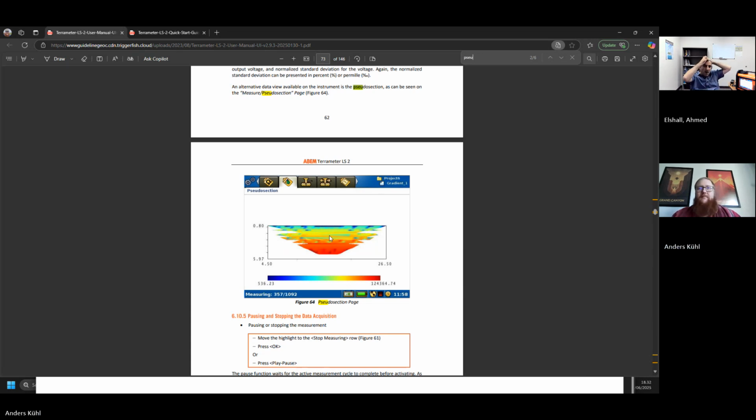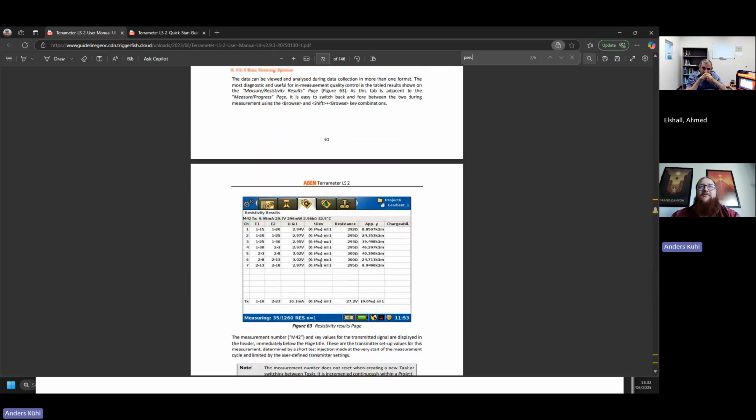Okay. So it can be used basically to guide your work here. Yes, and to get an idea of whether we are getting good data, and are we getting value? Are we spreading the area well? So that you can see this during measuring as well.